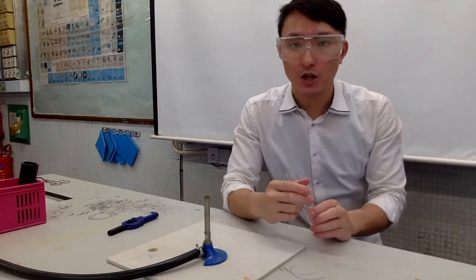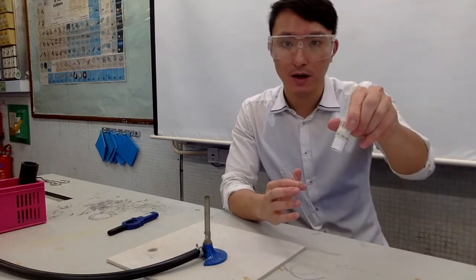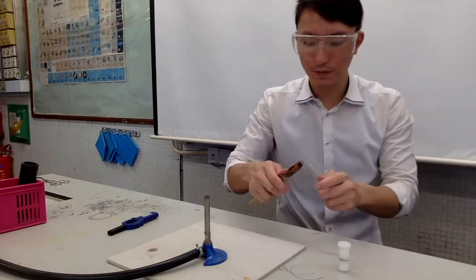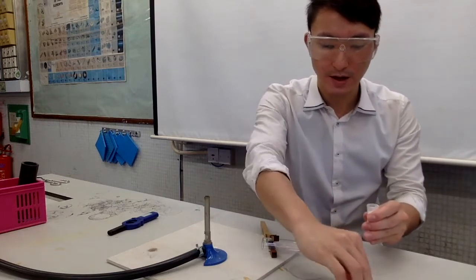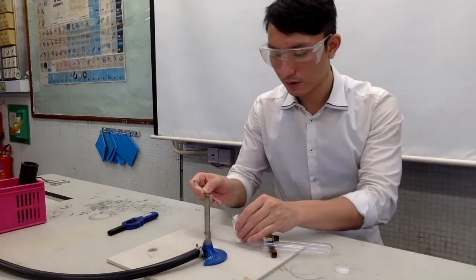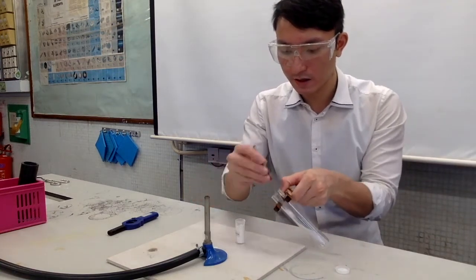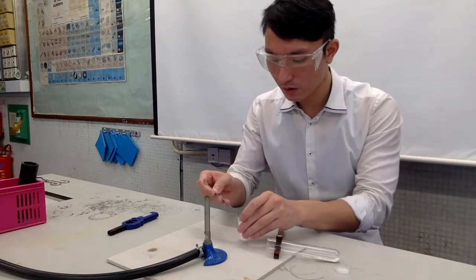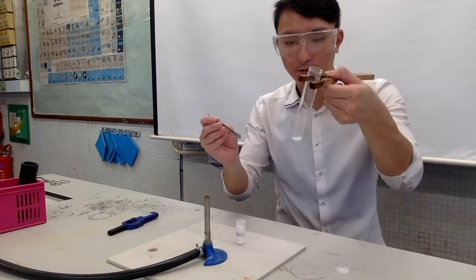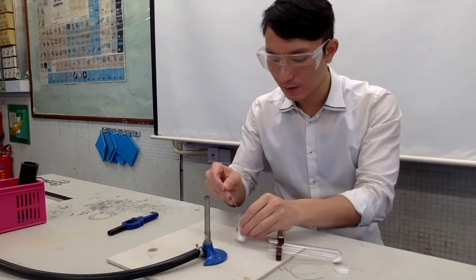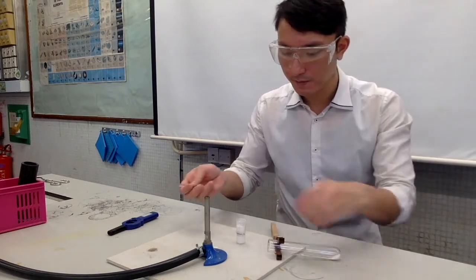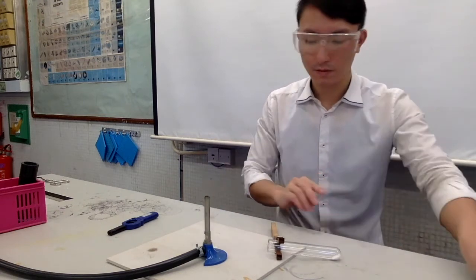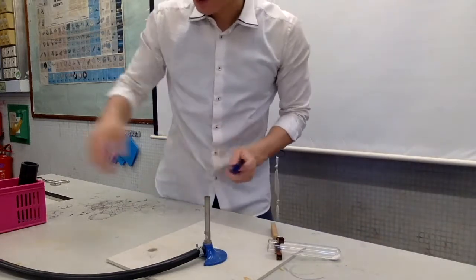This is calcium carbonate. We are going to add about three spatula measures of calcium carbonate — it doesn't have to be very accurate. One, two, three. That should do it, maybe a little bit more.